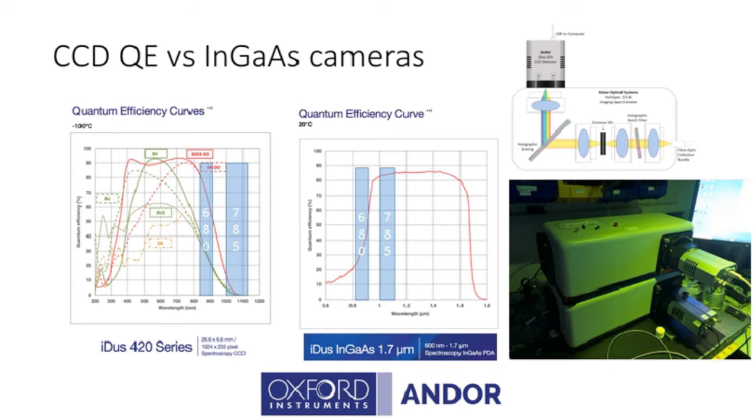If you use 680, we were still able to measure that band that I've put in blue, which shows you the spectral range we were able to measure here. And the 785 one is what would happen if we were using a 785 laser. So you can see why our sensitivity and our ability to measure the spectra has dropped off significantly.